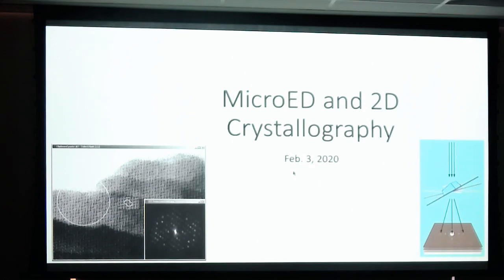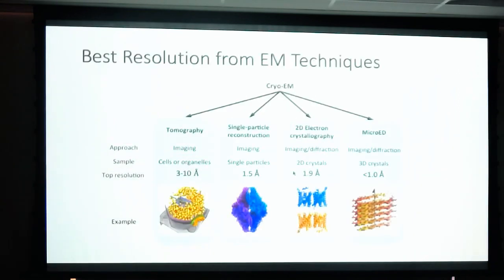So today I'm going to talk about microED and also a little bit about 2D crystallography, which is kind of an older technique, but was actually the first technique that worked pretty well for cryo-EM. These are the main four modalities of cryo-EM that are in use or have been in use, and they're all going to be covered in this course.